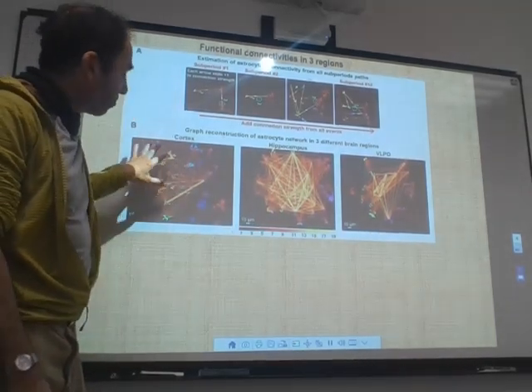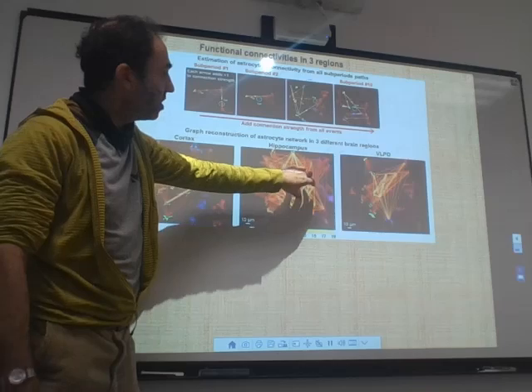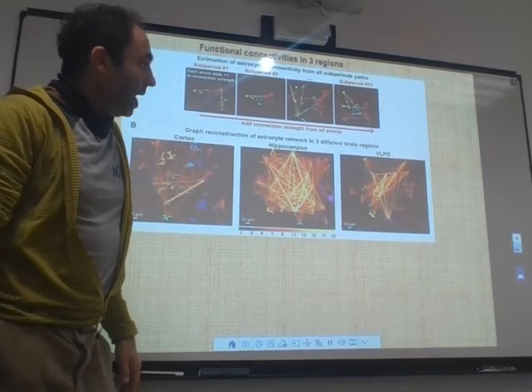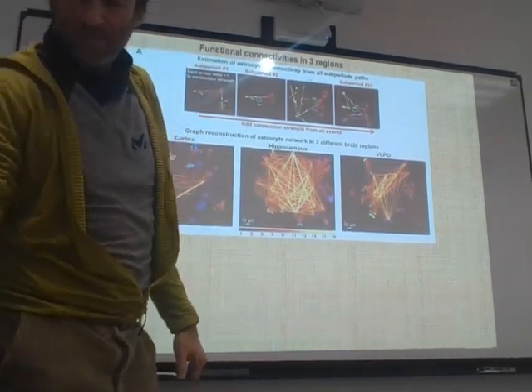One was more or less homogeneous, but for this one you could see there is a red part and there is a yellow part, suggesting that there are subgroups that were more preferentially activated. And similar for the VLPO, it was in between the cortex and the hippocampus.